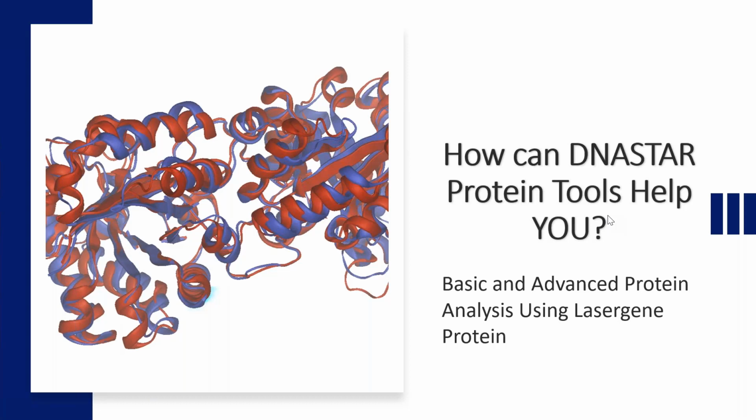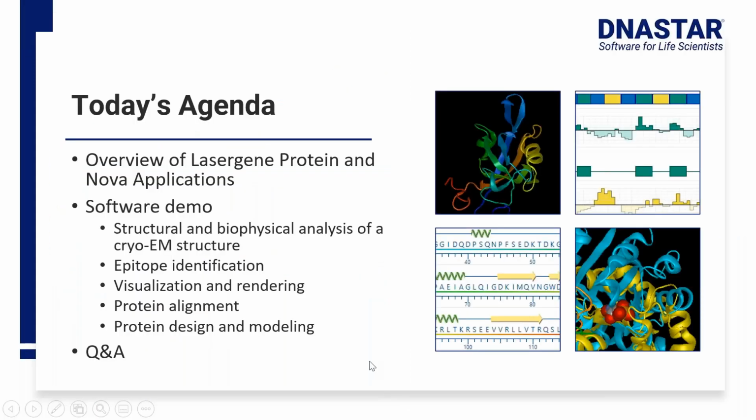DNASTAR protein tools provide a wide range of analysis and modeling options, and Thomas Leary is going to show you a couple examples of those. What I'm going to do here is just give you a high-level overview of what some of these tools are capable of, so that if you want more information or want to do a webinar with your colleagues more specific to your research and your needs, we can set that up.